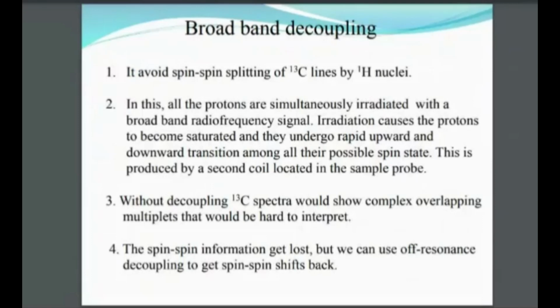The word broadband itself gives a fair bit of idea. What is done is the molecule is kept in an external magnetic field. Now, obviously, both C13 and H1 will align themselves either in the direction or against the direction of the magnetic field. Now, the problem happens when H1 has coupling interaction with C13.